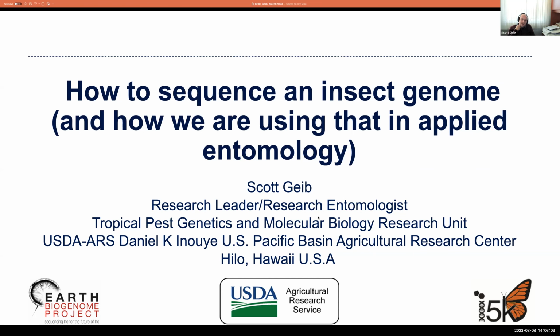Yeah, so our lab prepared the locus samples for DNA sequencing on PacBio, as well as sent samples to the Baylor group and performed some of the DNA assembly and things. So I'm going to cover kind of the ways we go through that. I know you had calls with Erez and Olga already, I believe. And so I'm kind of staying out of the higher level scaffolding and assembly and things like that.